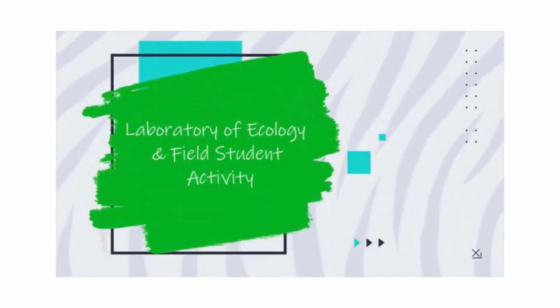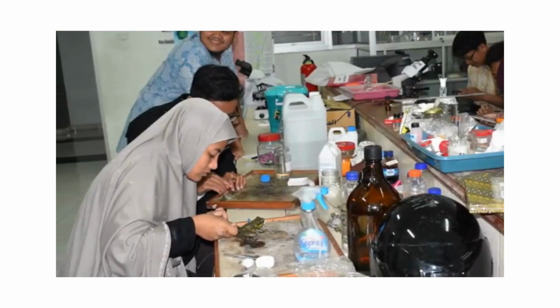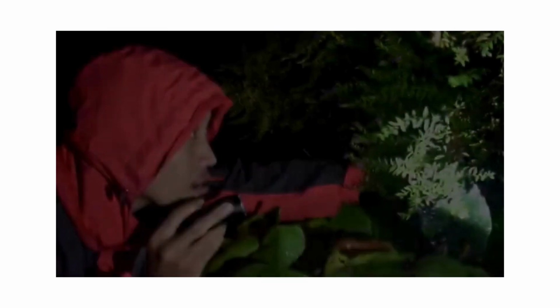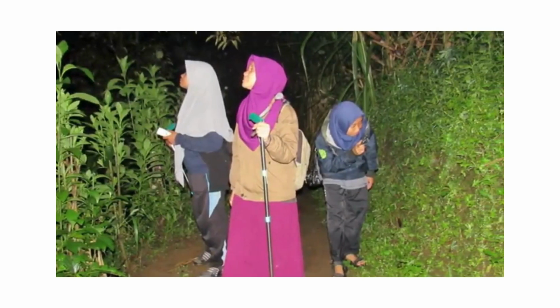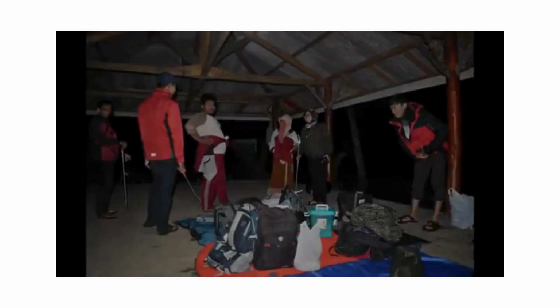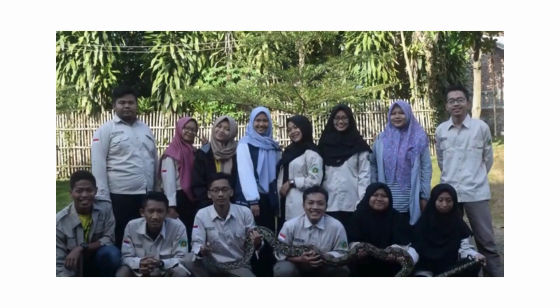Laboratory of Ecology and Field Student Activity. The Laboratory of Ecology can support both indoor and outdoor research, including practice study for biodiversity and ecology-based courses. The laboratory, which is located in the Department of Biology facility, can accommodate 40 to 50 students. The laboratory is well equipped with the latest field research equipment from basic to advanced, which can support exploration, monitoring, as well as environmental study. The laboratory can be accessed on a daily schedule during working hours from 8 a.m. to 4 p.m. Laboratory of Ecology activities are mostly conducted in the field.